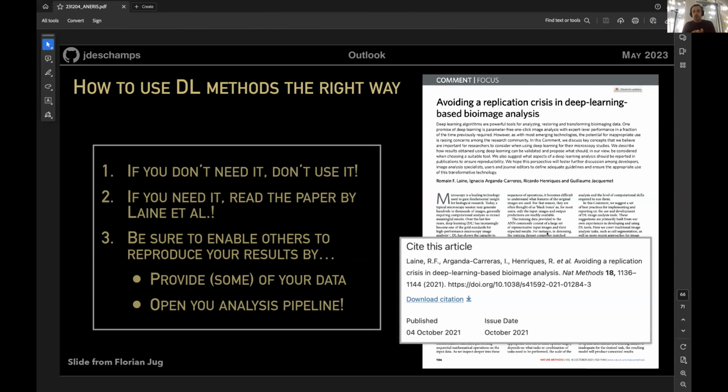If you do need it, read the literature on how to best do it. There's some good nuggets of knowledge in this paper. And be sure to enable others to reproduce your results. So provide your data as much as possible openly. Give your trained network and also your training routine to the community. Make sure that you share these things.